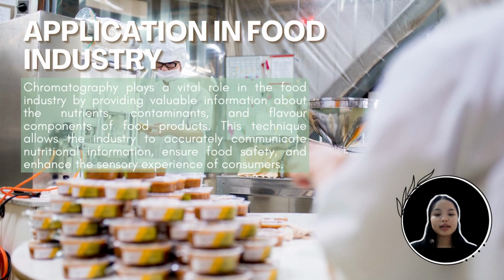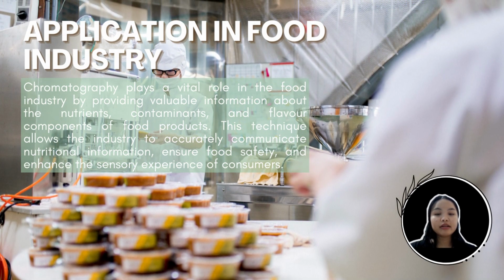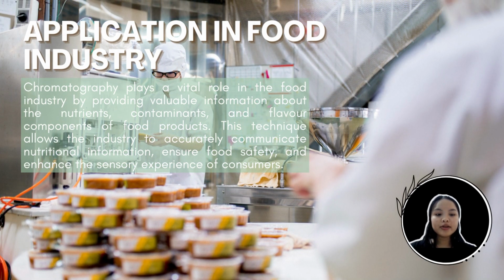Chromatography is a technique that has gained significant popularity in various industries. However, one industry that extensively relies on chromatography is the food industry. This method provides valuable insights to the food industry, allowing them to offer precise and reliable information about the nutrients present in a specific food item, among other advantages.